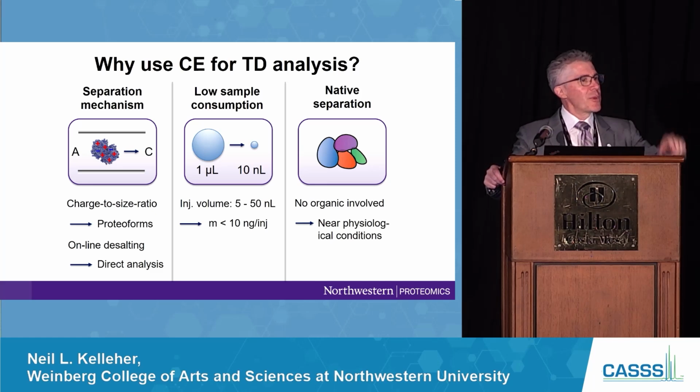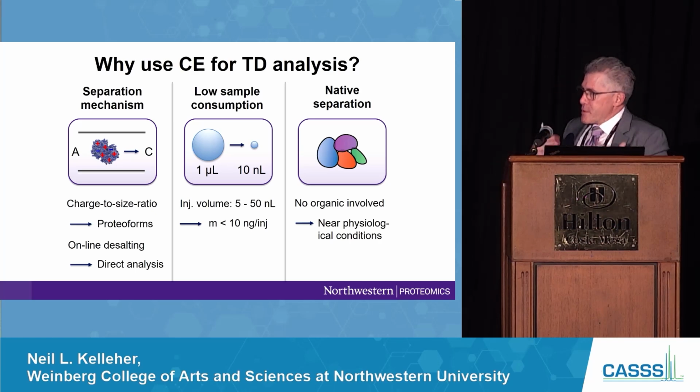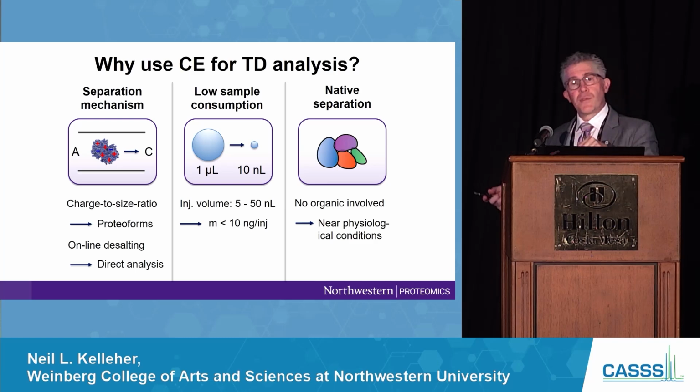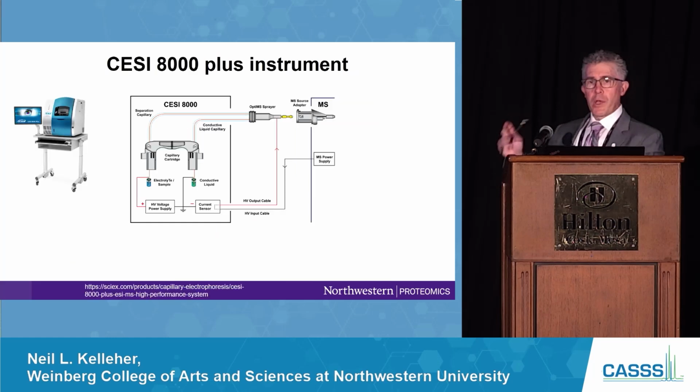I just saw 8 capillaries out at the SciEx booth. And so, with these things, you can start to see how to scale this kind of approach where it's tiny sample consumption. And now we've got both denatured and native mode CZE, and you'll see examples of both. So I won't belabor this.